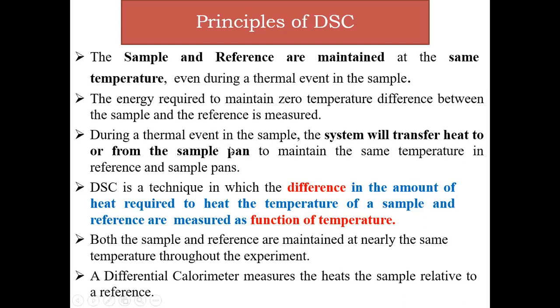During the thermal event in the sample, the system will either transfer heat to or receive heat from the sample. So in this thermal event, there are two possibilities: either the system will transfer heat or it will take heat from the sample pan to maintain the same temperature in the reference and sample pan.